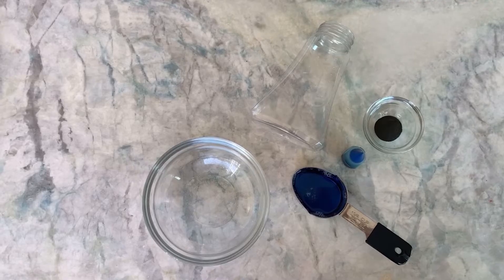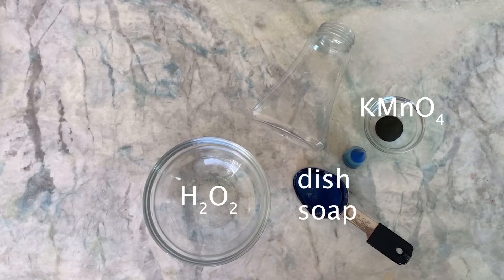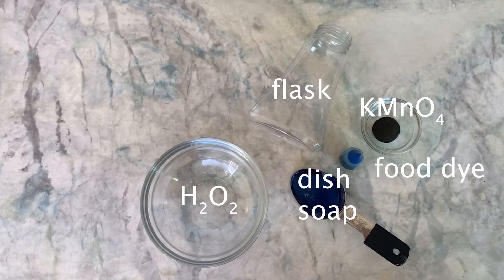For this experiment you're going to need the following items: potassium permanganate, hydrogen peroxide, dish soap, a flask-shaped container, and food dye — but that's optional.